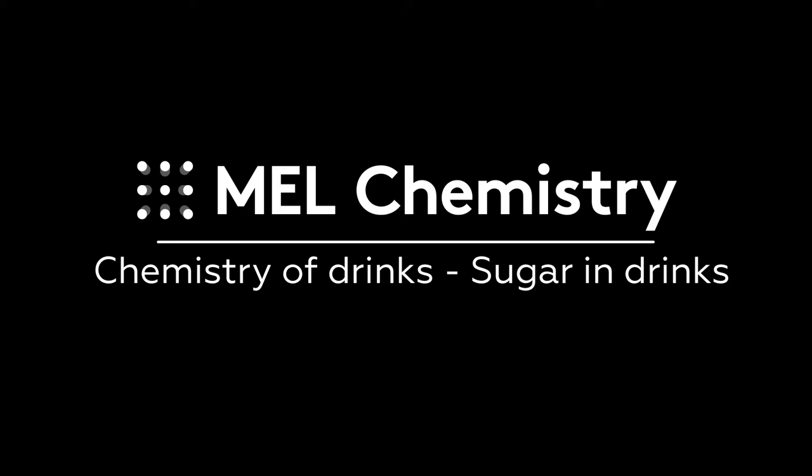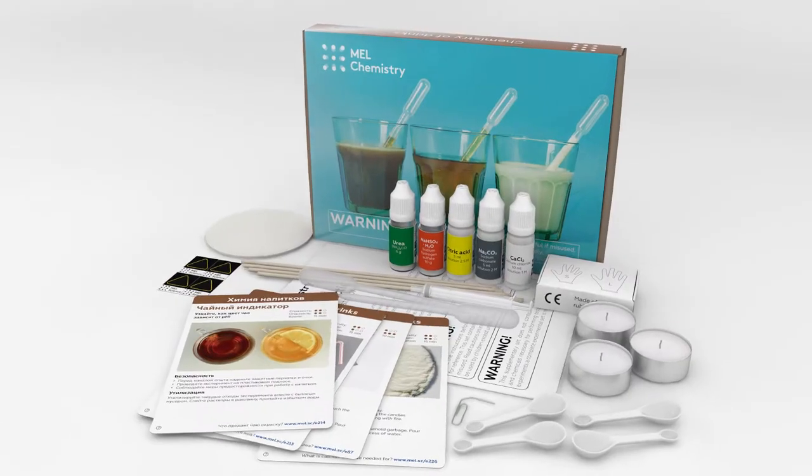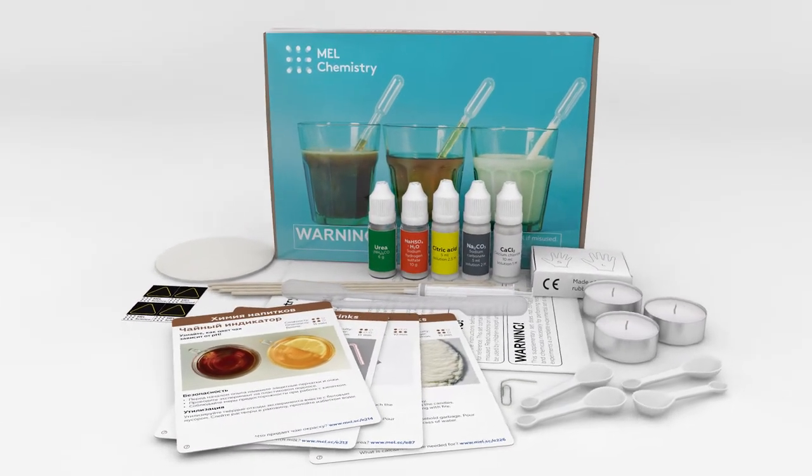Welcome to the wonderful world of chemistry. Today with the help of the chemistry of drinks set by Mel Chemistry, we will find out if there is sugar in any particular soda.